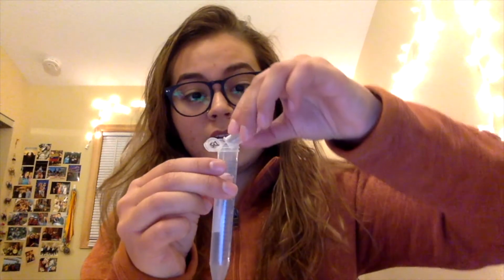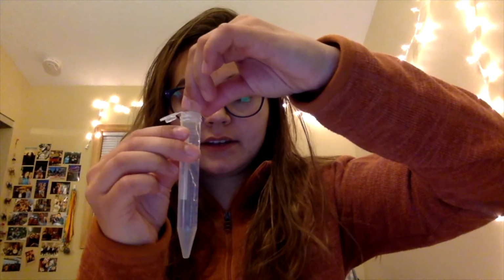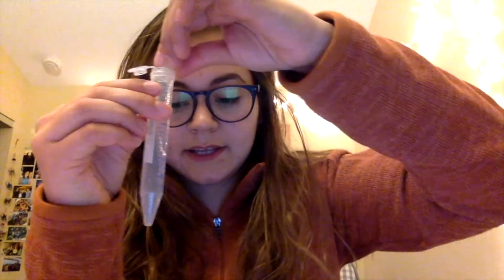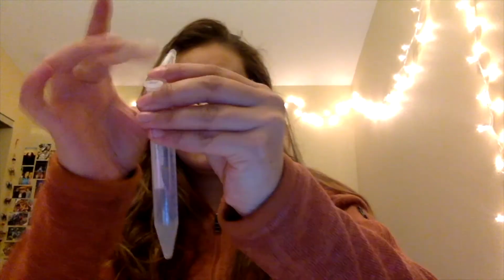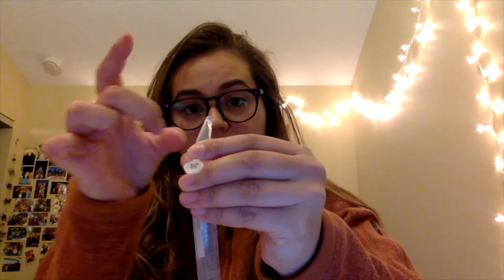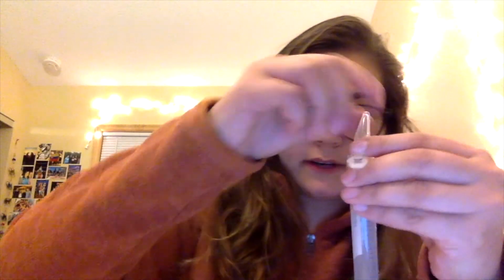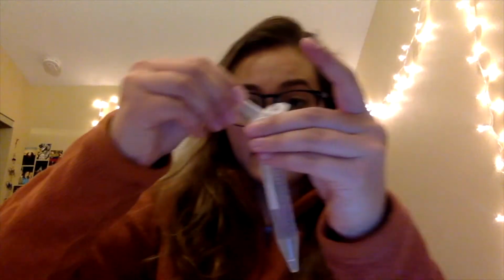So we're going to pour it here. Make sure that everything is there. You can give it a little tap if it's sticking to the sides. Just be patient. All right, once that is all out, close that.